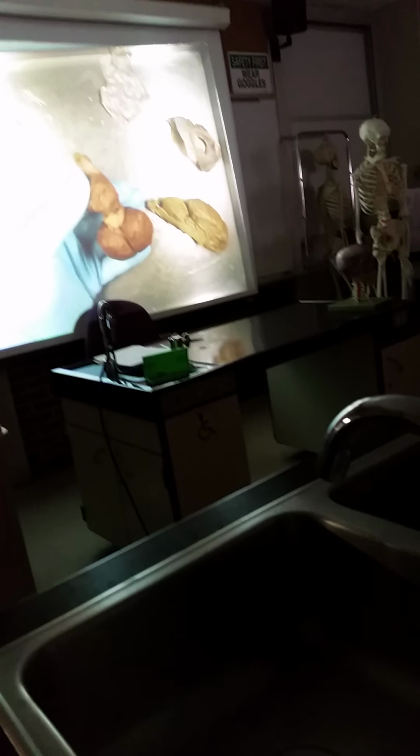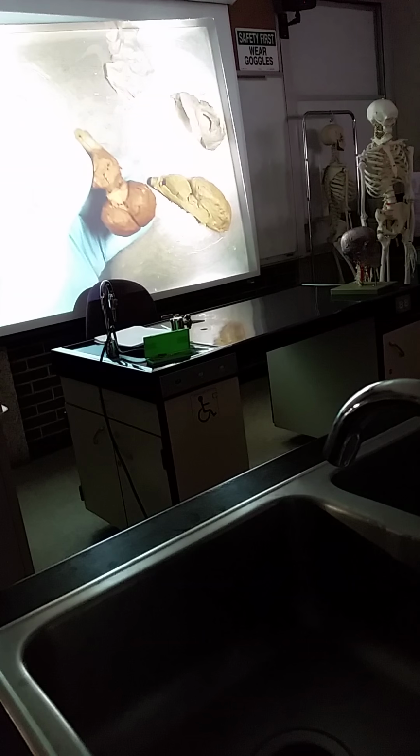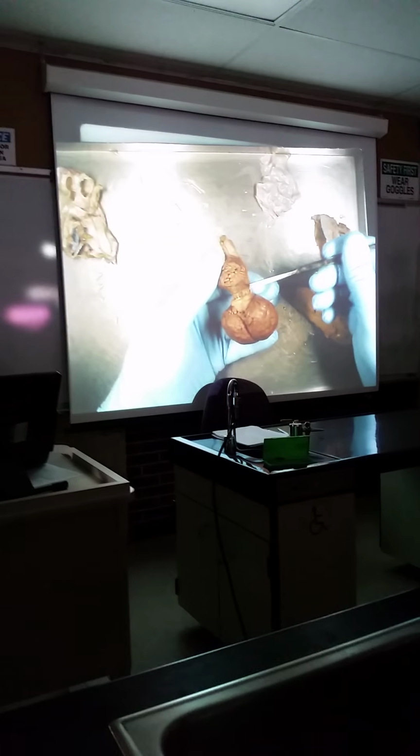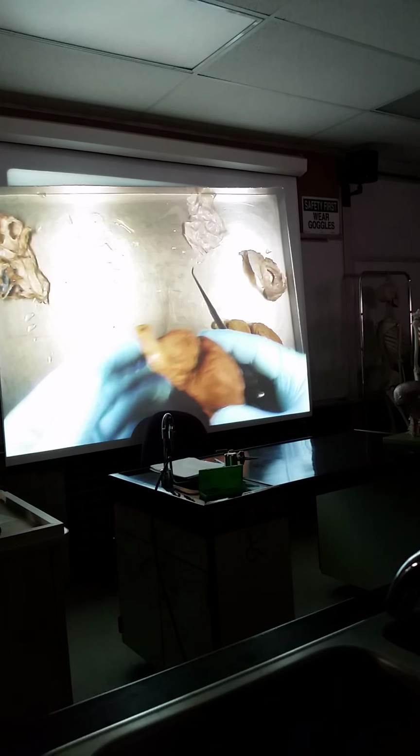Cerebellum. Cerebellum's right there. What are those squiggly things between the corpora quadrigemina and the cerebellum? Right here? Yeah. Cerebellar peduncles. Those are peduncles, okay. Yeah, cerebellar. They've almost ripped through them. I'm trying not to. But those are cerebellar peduncles.